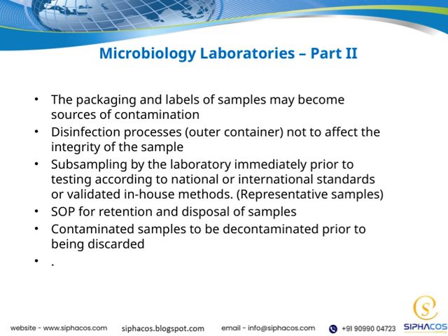Additionally, having a clear SOP for the retention and disposal of samples is essential. It helps us maintain consistency and compliance and make sure contaminated samples are handled properly. If a sample is contaminated, it must be decontaminated before being discarded to prevent any risk of cross-contamination or exposure. All of these points tie back to our overall goal, maintaining sample integrity and safety throughout the microbiological testing process.